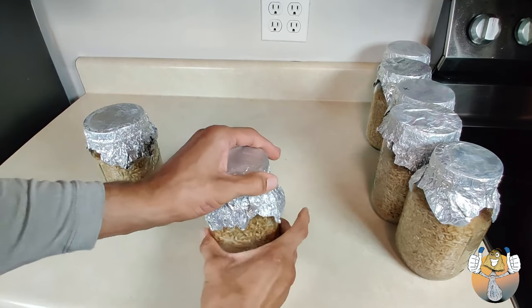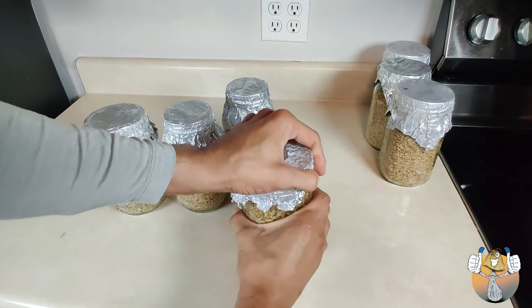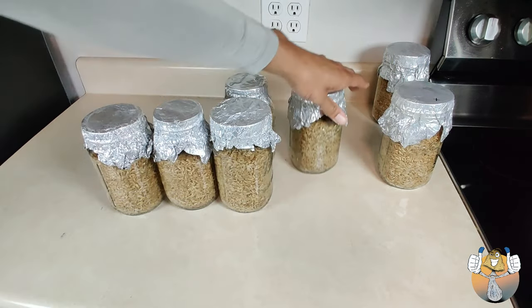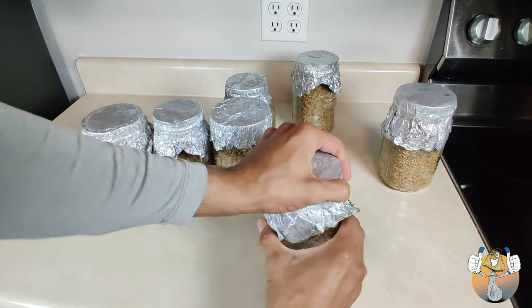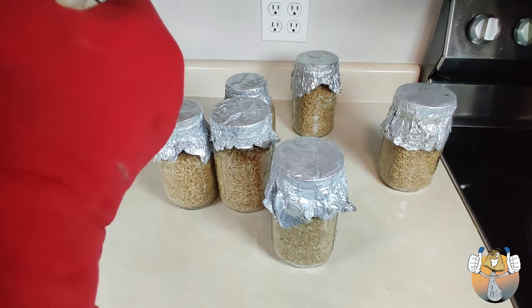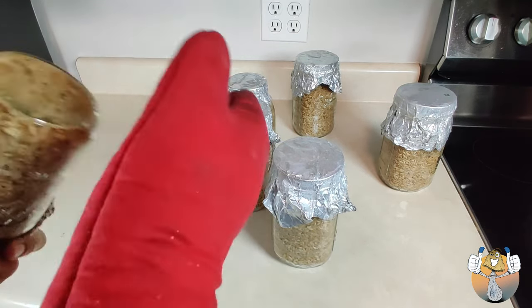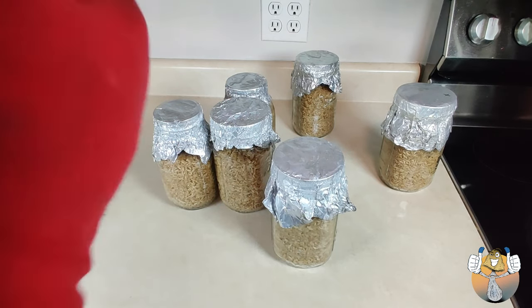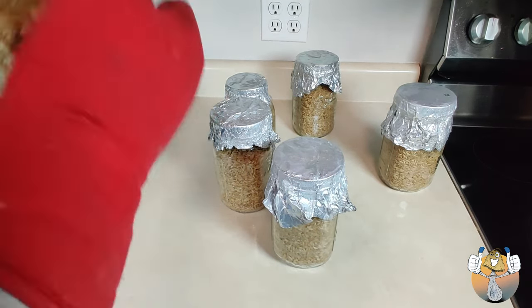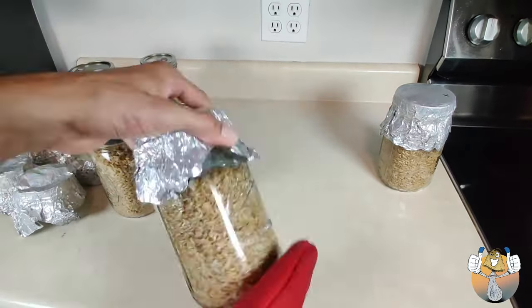So be mindful, this is very hot. I don't know why I'm doing this bare hands. We're just going to go ahead and tighten our lids before we start shaking them up. Now, the lid with the X is our unmodified lid. Just give these a nice shake. Make sure we redistribute any moisture that's in there, and make sure our grains are not all clumped together.